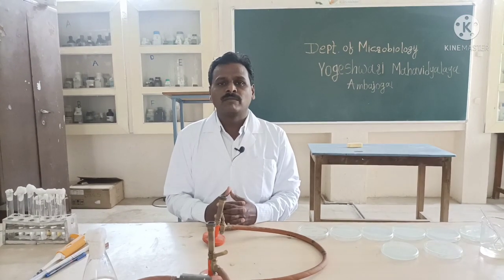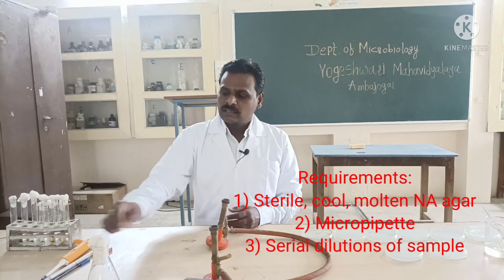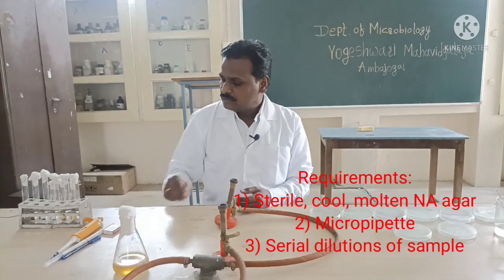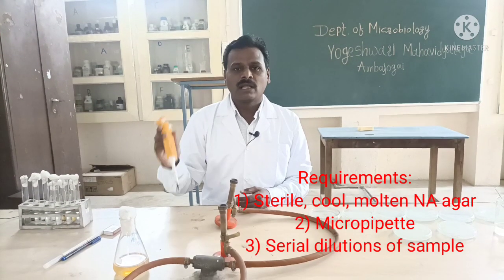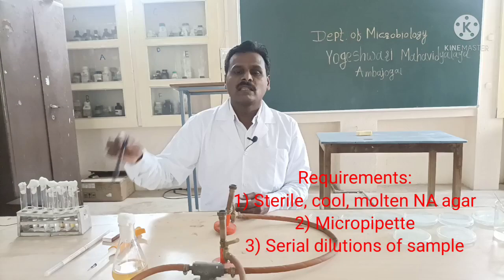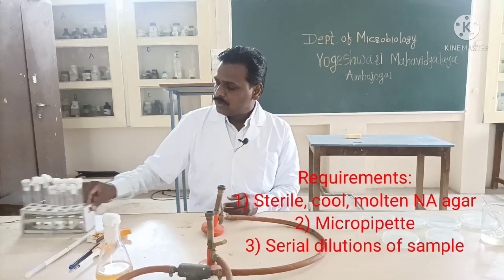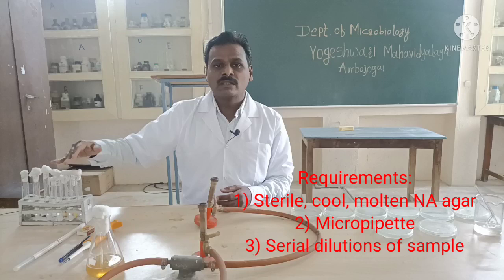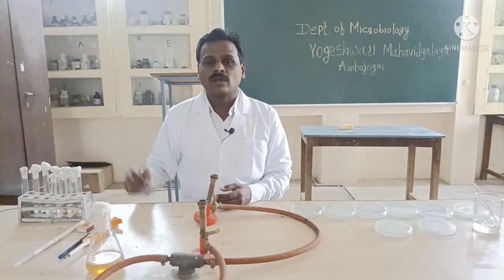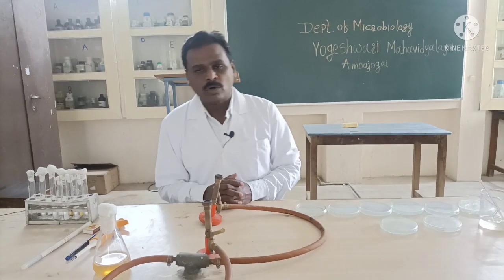What is the requirement for the pour plate method? The requirements are: sterile molten cool nutrient agar, then we should have the pipette — we are having the micro pipette — then glass marking pencil for marking the plates and the test tubes, and we should have the different dilutions in the test tubes containing sterile water. So all the requirements are ready with us, let us start with this pour plate method.